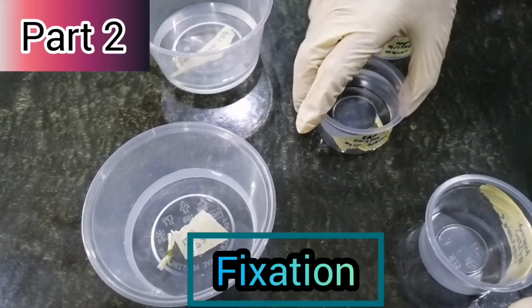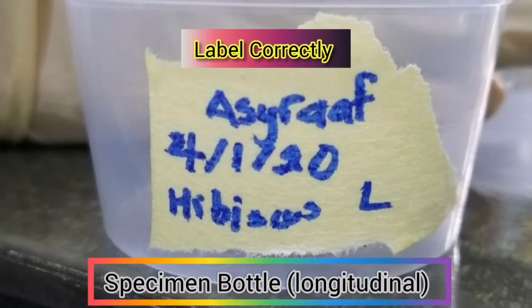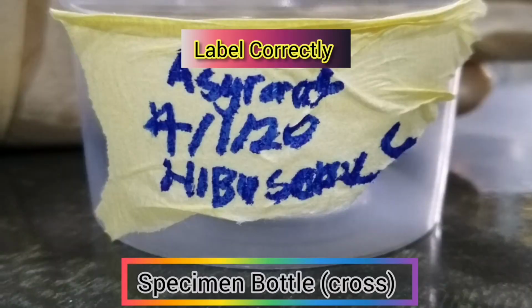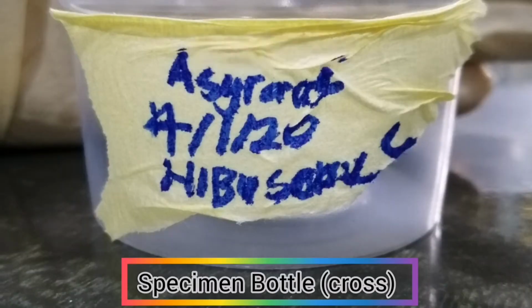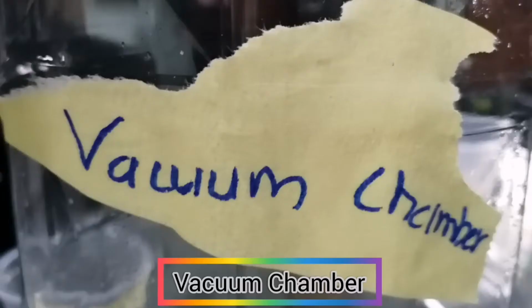So the next part is the fixation part. The ingredients we need are the EAF fixative mix solution, specimen bottle for the longitudinal section, specimen bottle for the cross section, incubation chamber at 4 degrees Celsius, and a vacuum chamber.